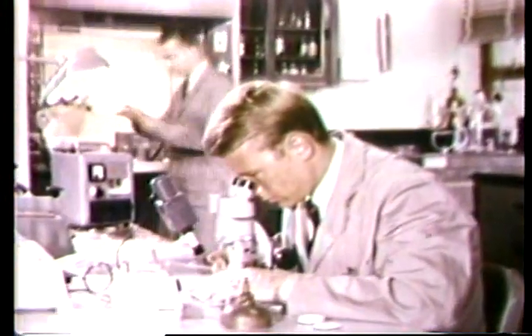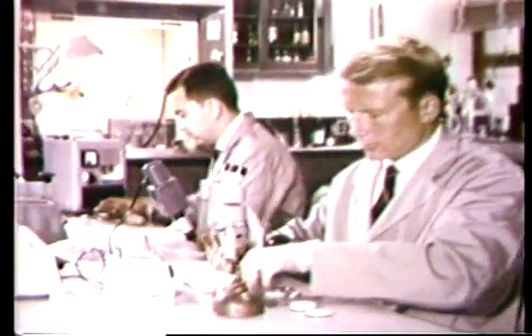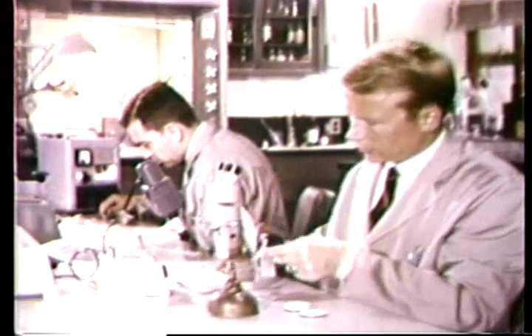Neutron Activation Analysis is the name given to a technique employed in the FBI laboratory to provide a sensitive and accurate method for the examination of physical evidence.